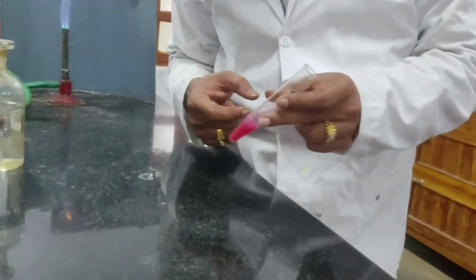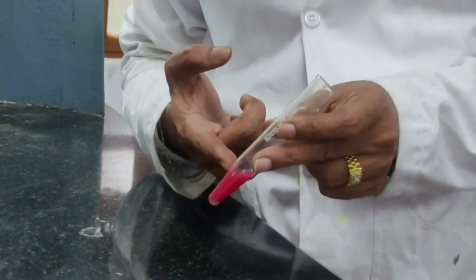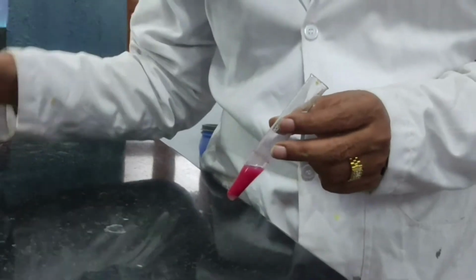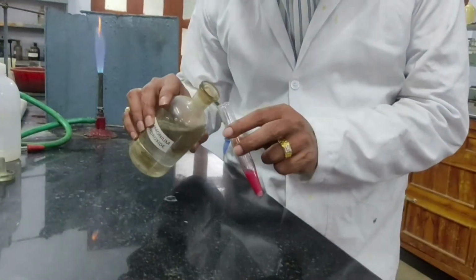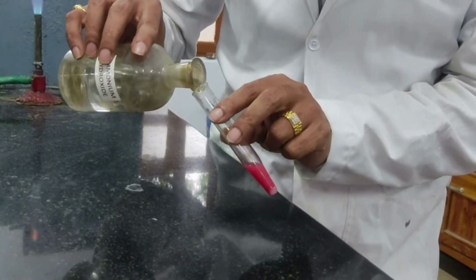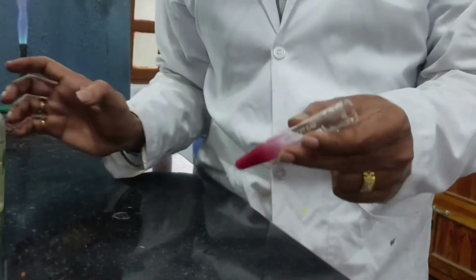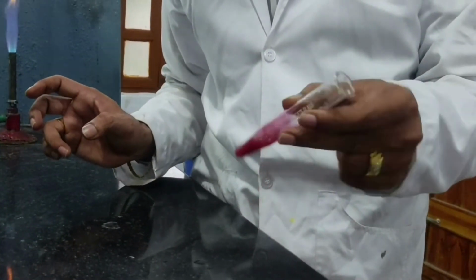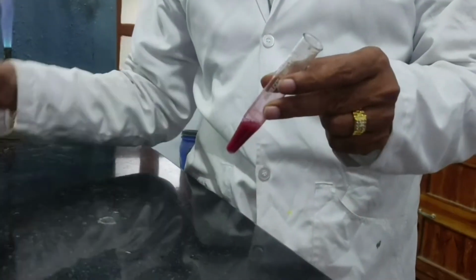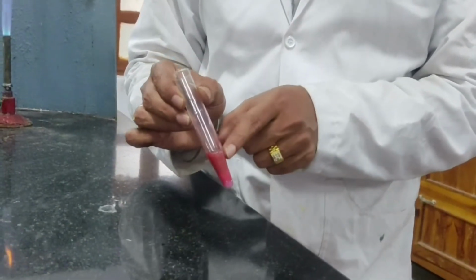See, I got a scarlet red color precipitate. So this is indicating the presence of nickel plus 2 ions. If I add a little amount of ammonia, the precipitate gets intensified. You see the precipitate is getting intensified by the addition of ammonia. So this is a scarlet red color precipitate obtained for nickel plus 2 ion.